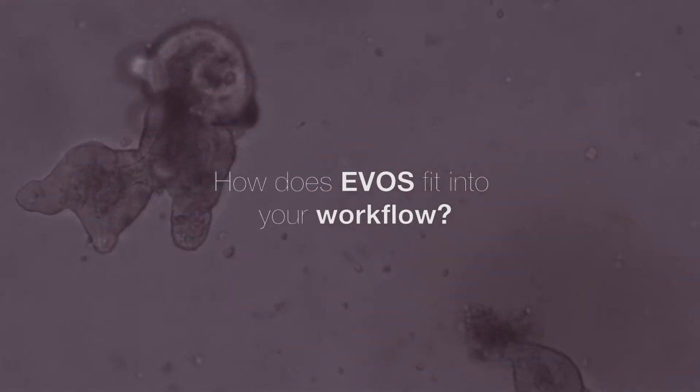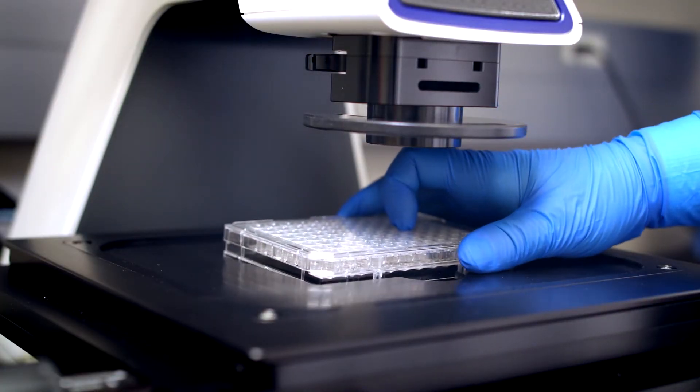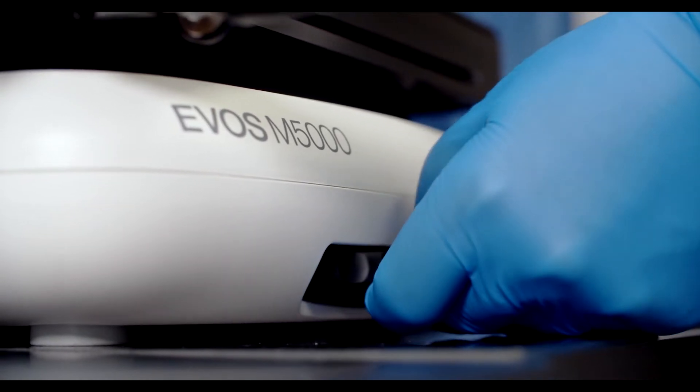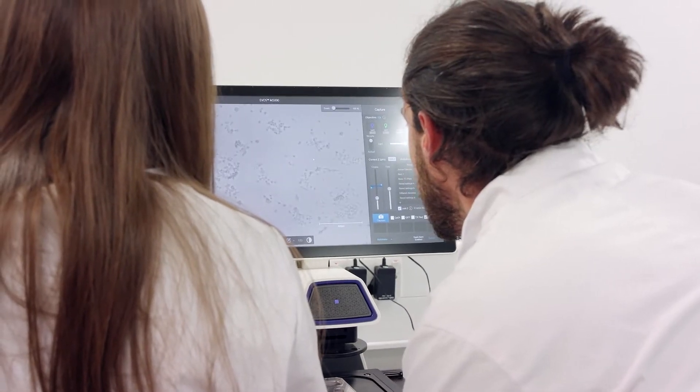So it is sitting in our tissue culture and it's being used as the main instrument there for checking on your cells, for counting your cells, also when you do passaging and so on, but also checking on fluorescent levels. Basically if you have a reporter line that expresses X, Y, Z as a protein, you can always check with the EVOS quite quickly.